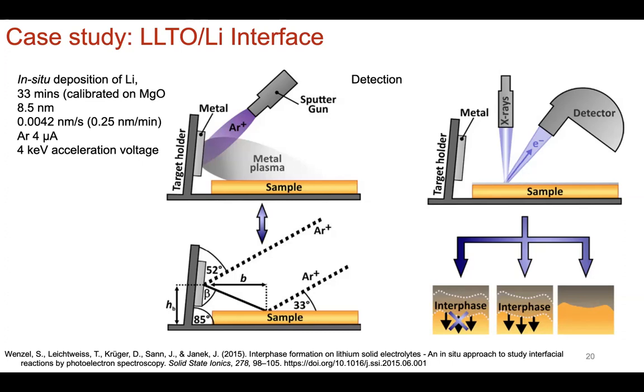As in, if you just had your sample, this yellow region, and let's say you put it in air or whatever surface, those phases might not form because it's not interacting at the interface with a dissimilar material that's causing it to decompose thermodynamically or what have you, or chemically, electrochemically. So these interphases are defined by what the interface is. So the solid electrolyte interphase is the phases that only form at the solid electrolyte interface.